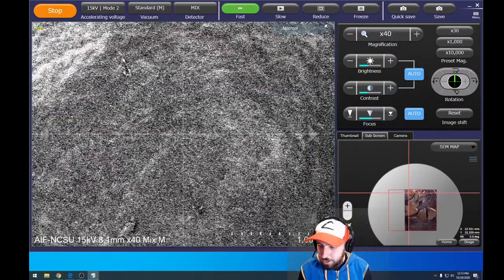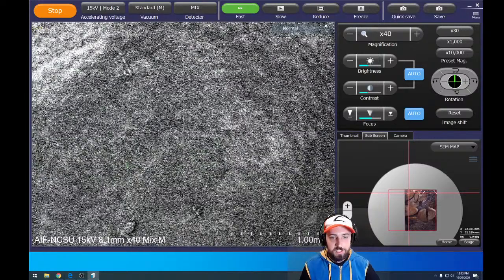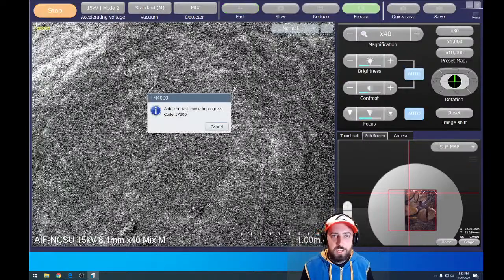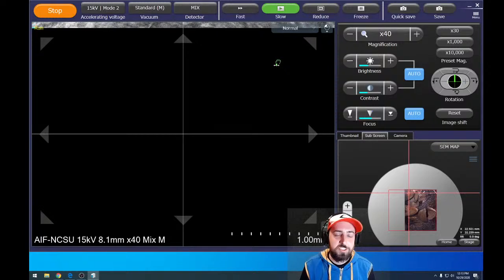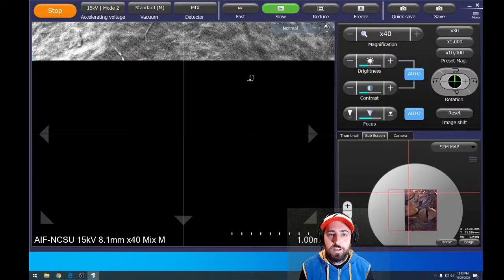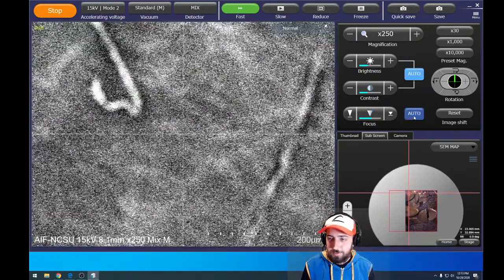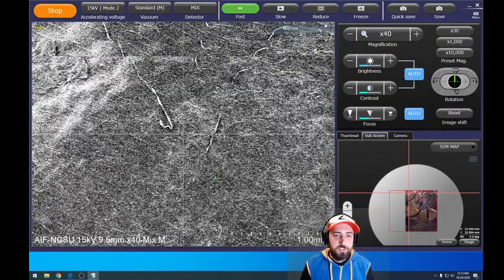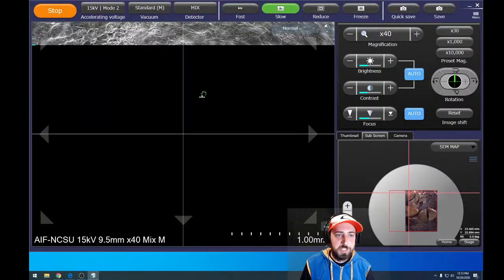All right, so now we're on the pumpkin seed, and this is just the outside of the pumpkin seed. So just as we saw it in the optical image, I'm gonna refocus and change the brightness, and now we're gonna start scanning slow and then see what we see. See, I don't really like that focus. I think I can do a little bit of a better job. Let's try it again. There we go. All right. Now let's scan slow and see what that looks like. All right, so that's a much better picture.